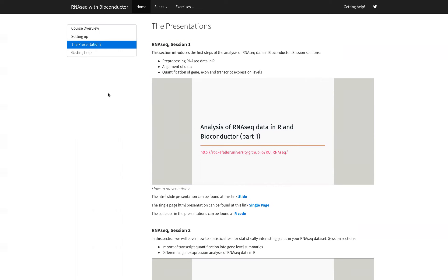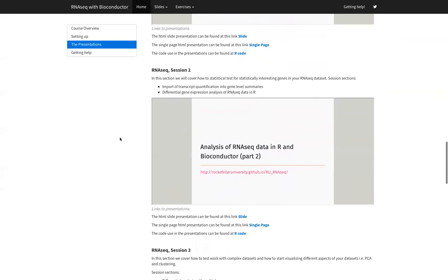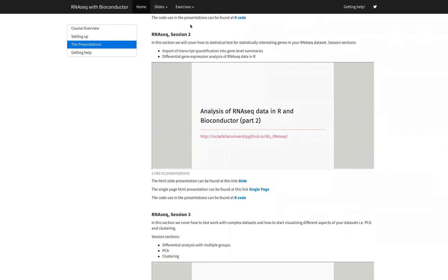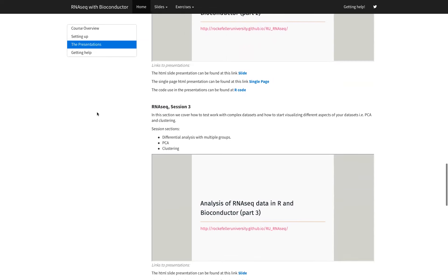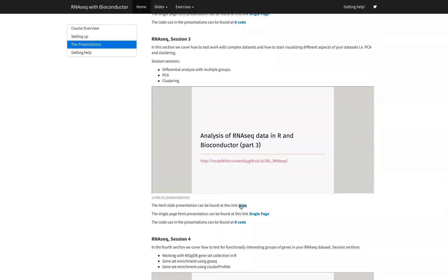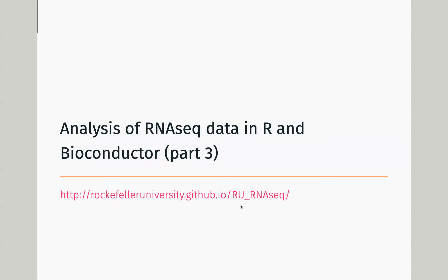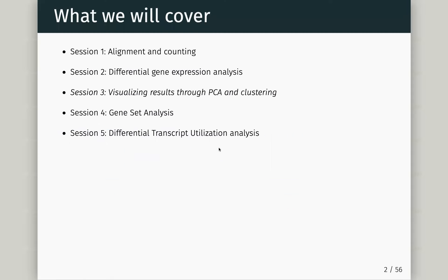Remember, if you have your own FASTA, your own GTF, all of this we can do without using the Bioconductor annotations. We then quickly went through how we can import this into a summarized experiment object and then into a DESeq2 object, and it was there that we could already do some pairwise comparisons, which is the majority of the analysis we need to do. So in this session, it's actually combined some other sessions together. Usually I would split out the visualization into its own session, but through feedback from people in this class, they want to do this in the middle of RNA-Seq. So we've covered alignment and counting — going from raw data to read counts — and we looked at how we can do differential gene expression analysis, one sample versus another.